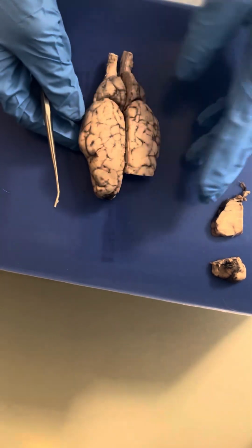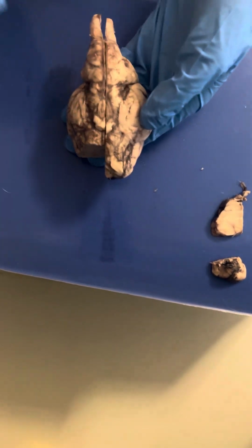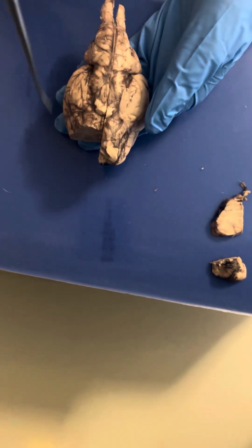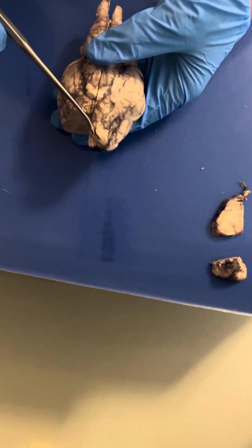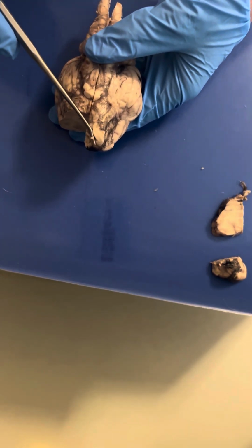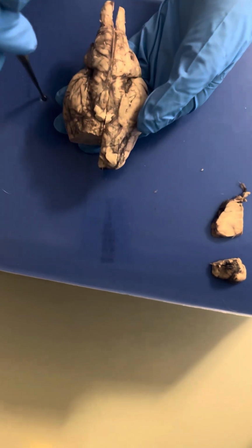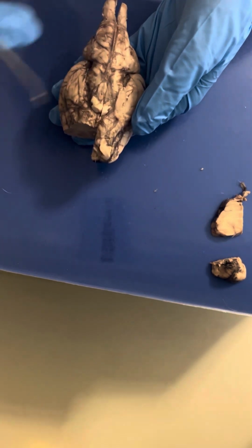So now that we have taken a look at the outside, we're actually going to flip it over to get this more ventral view. And it is noted that there are 12 different cranial nerves that send electrical signals. However, they were cut for the dissection. But luckily we can still see the olfactory bulb if we move up here anteriorly, which holds the olfactory nerves. And then there's supposed to be an X-shaped section and that is the optic chiasma, and that is where the optic nerves cross.